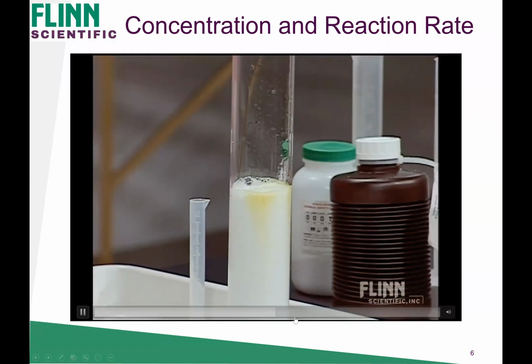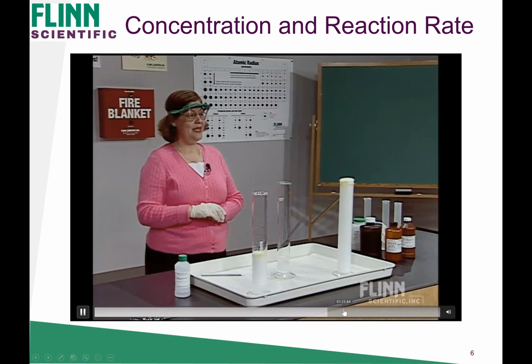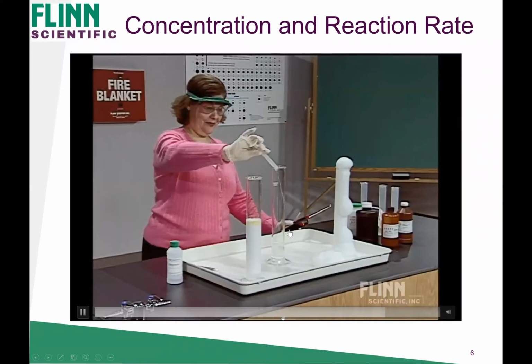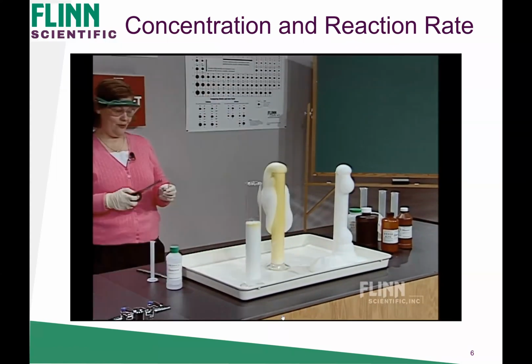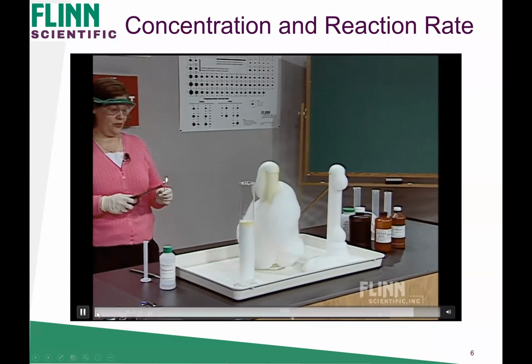And now we're going to go ahead to our highest concentration and see what happens here. So now we're going to add our catalyst to a high concentration, and now you see how fast that goes relative to the other ones. So you can see a marked difference in reaction rate across the three concentrations, okay?